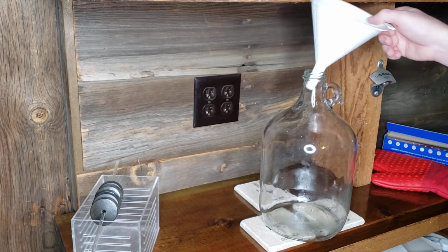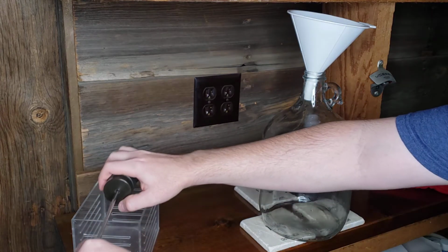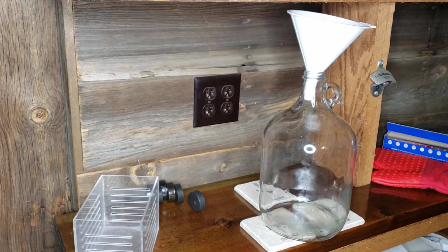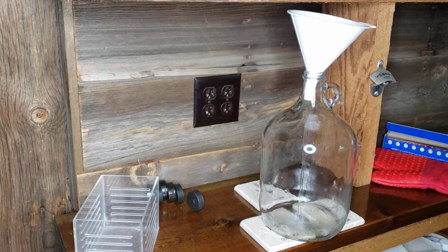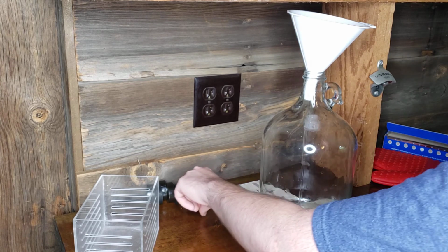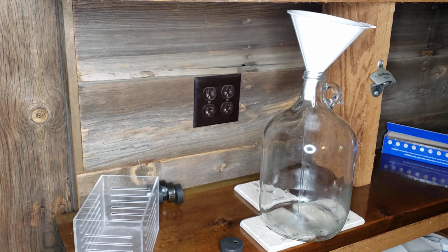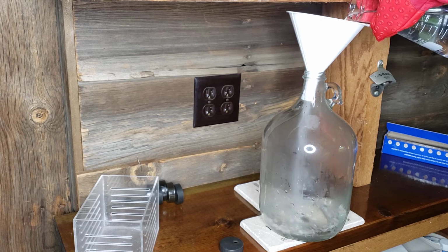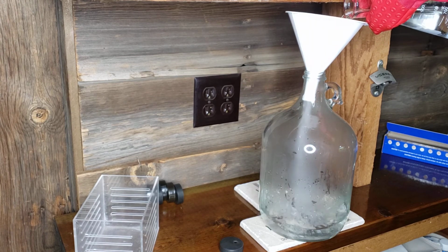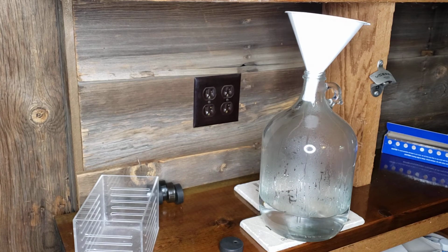Alright, microwave just finished. Get this all set up here. So what I'm doing here is I'm putting the glass air tube in here. Got the jug. Got some clean caps. Put the oven mitt on. Now this water is going to be really hot. So pouring it over the airline is going to help sterilize it instantly. Careful not to spill.